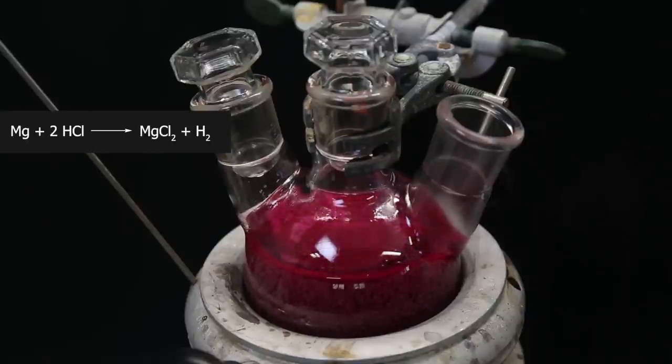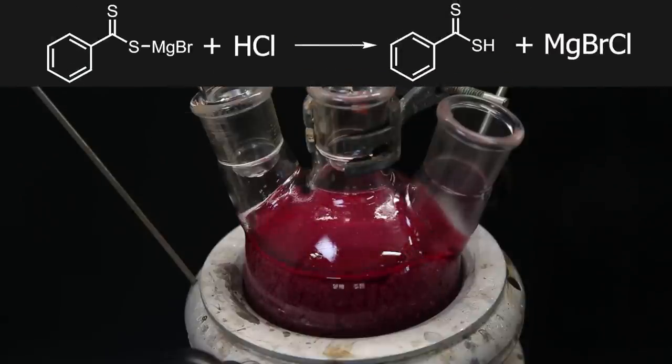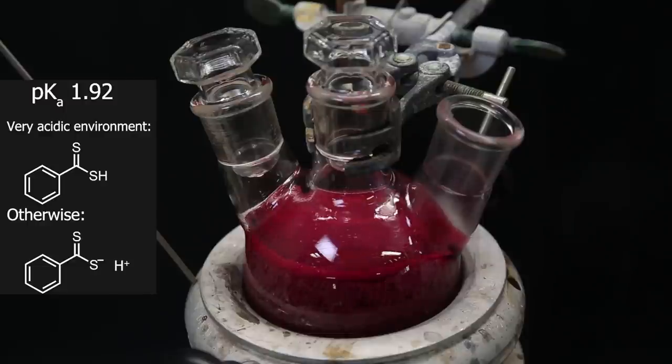The hydrochloric acid reacts with the diethylbenzoic acid magnesium bromide salt, to form the desired product, diethylbenzoic acid. Enough acid also has to be added, to make sure that the pH of the solution is low enough for the diethylbenzoic acid to stay protonated. If it's not acidic enough, diethylbenzoic acid will deprotonate, and stay dissolved in the water.